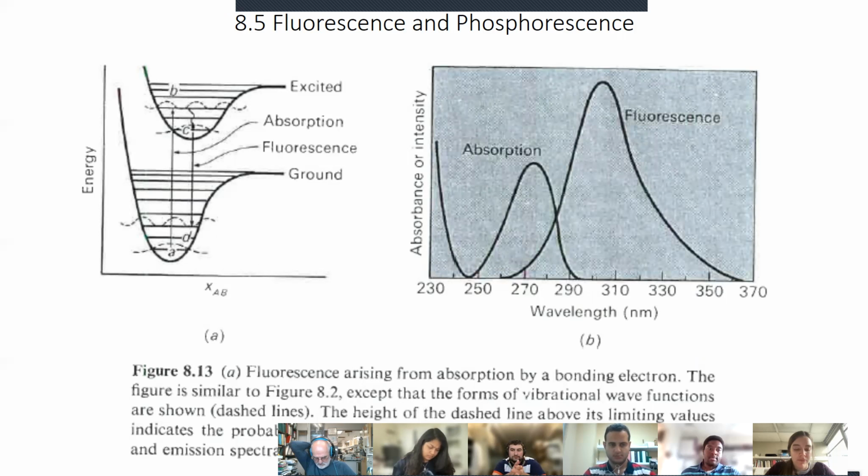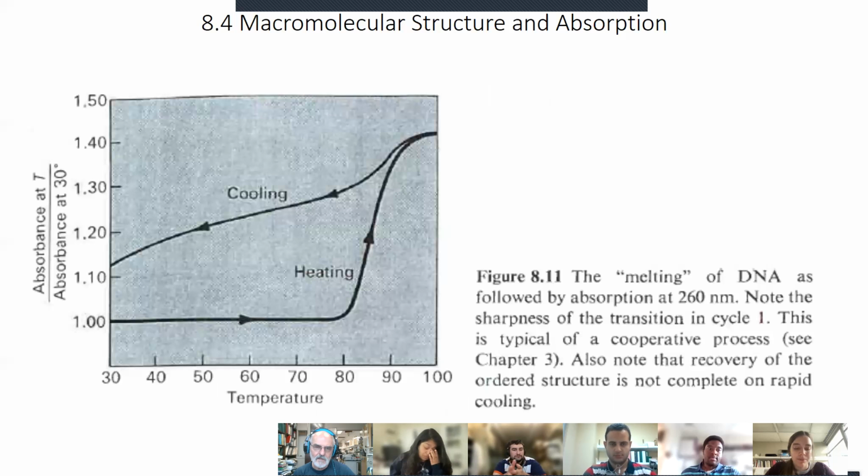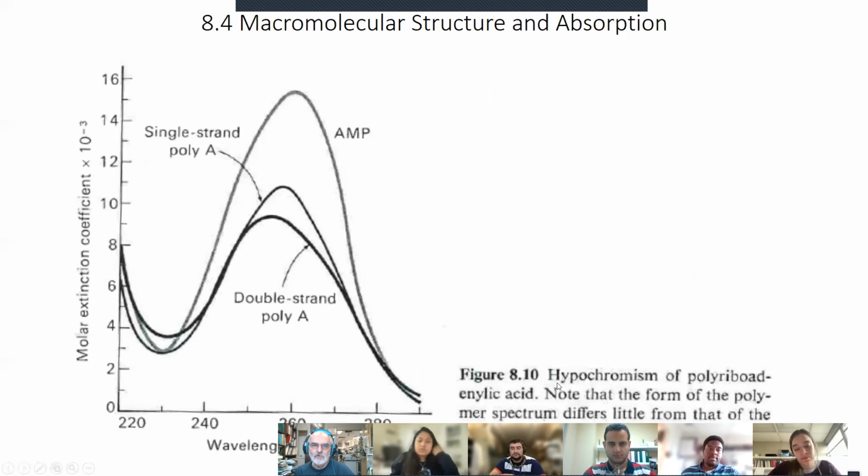Okay. And so generally speaking, when you do a concentration, you want to make sure in nucleic acids that you collect the data at a certain temperature so that the sample is completely denatured and you're making your measurements under denaturing conditions. But generally speaking, people don't trust it that much for absolute concentrations. It becomes difficult to do.